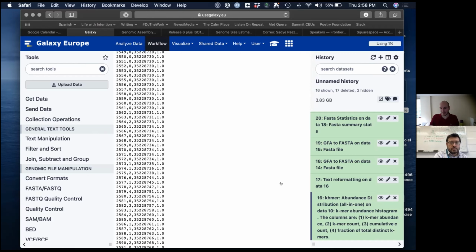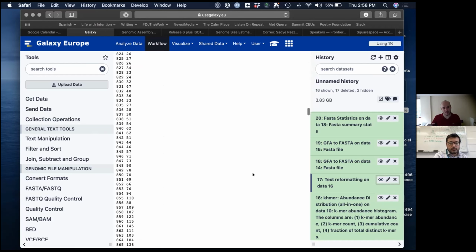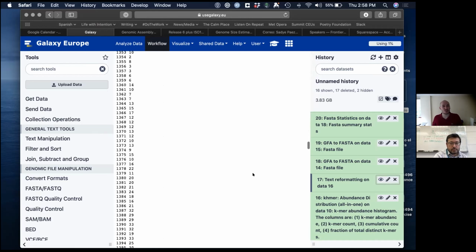So we get rid of them, and this is what you actually got in here. If you scroll down, now you will see that you're actually skipping some of these values because, of course, they were 0 and we don't actually need them. Just as a curiosity again, if you want to understand the AWK command, can you go to that page again?